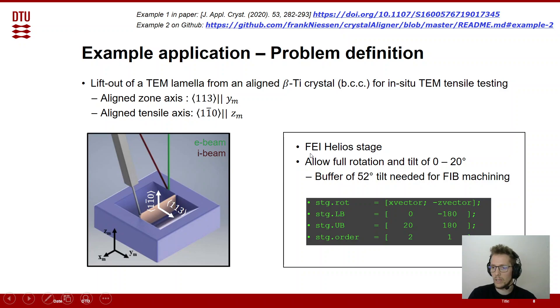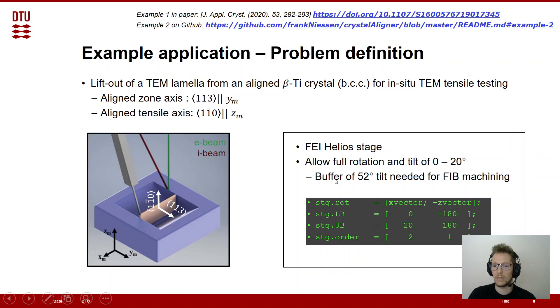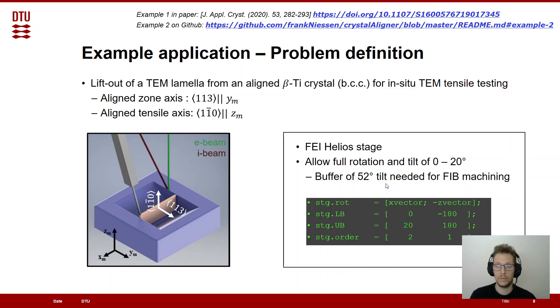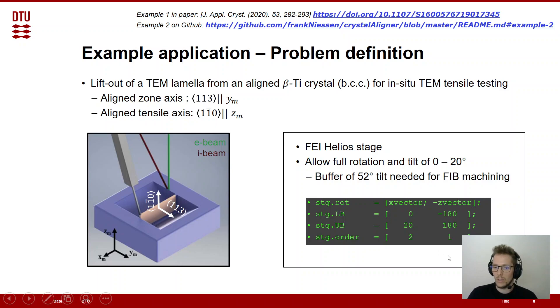We also need to define the stage — again the FEI Helios stage — allowing full rotation around the z-vector and tilt of 0 to 20 degrees. We limit ourselves to 20 degrees because we need a buffer of 52 degrees of tilt for the FIB machining. For example, if the perfect alignment requires 15 degrees of tilt, we then have to go to 15 plus 52 degrees tilt to do the FIB machining, so we set a soft limit of 20 degrees to not exceed our hard limit during FIB machining. The stage order is the same as shown earlier.